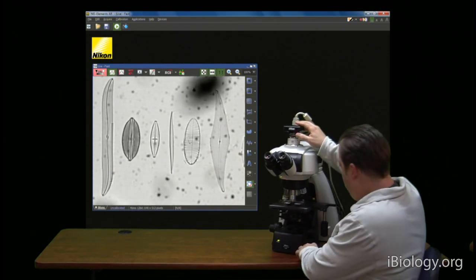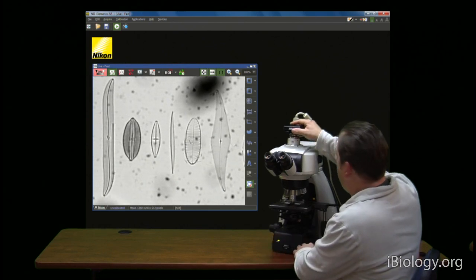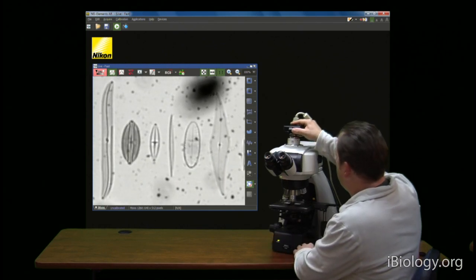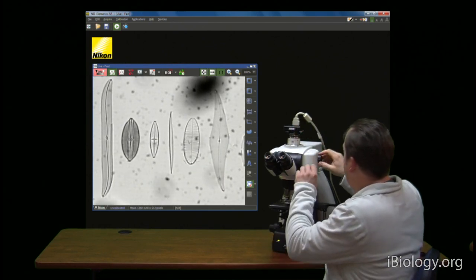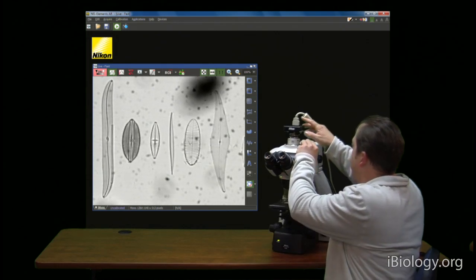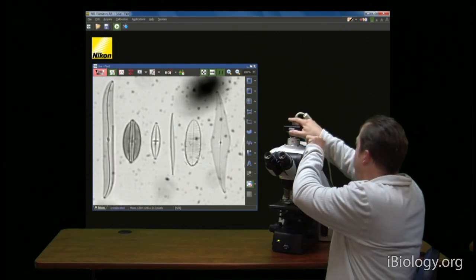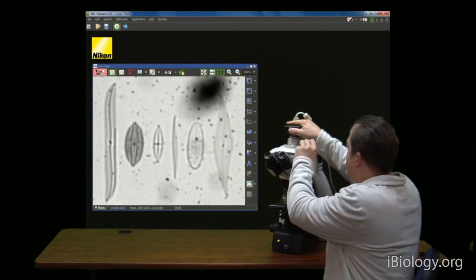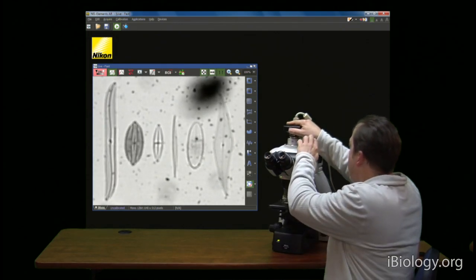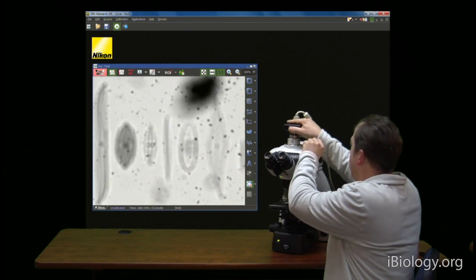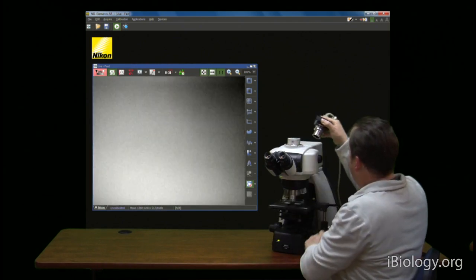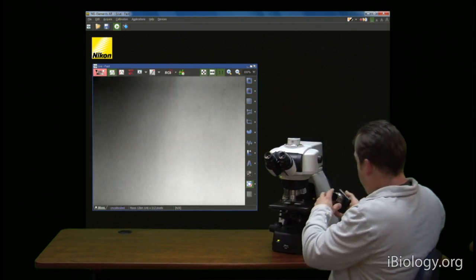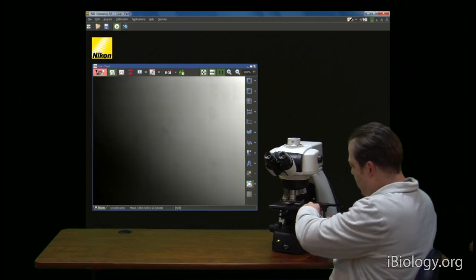So let's take the camera off the microscope now. Just loosen that up a bit and lift this camera out. Remove our ISO C-mount here.